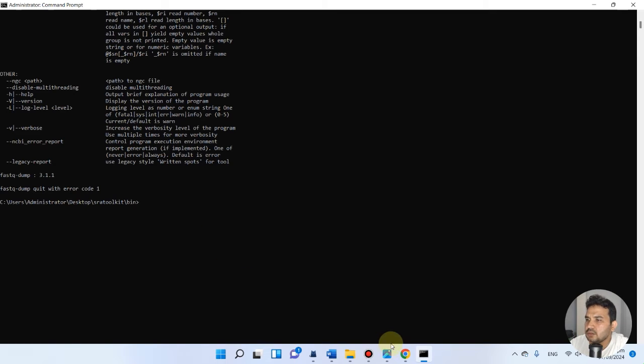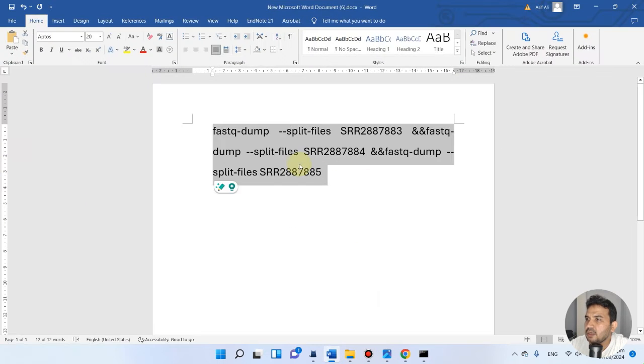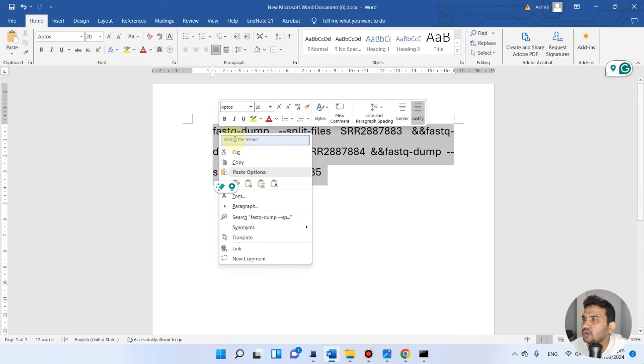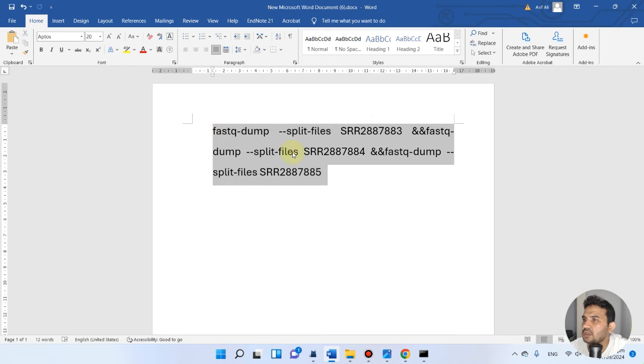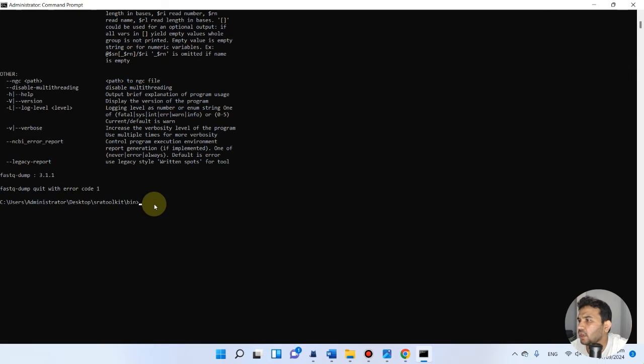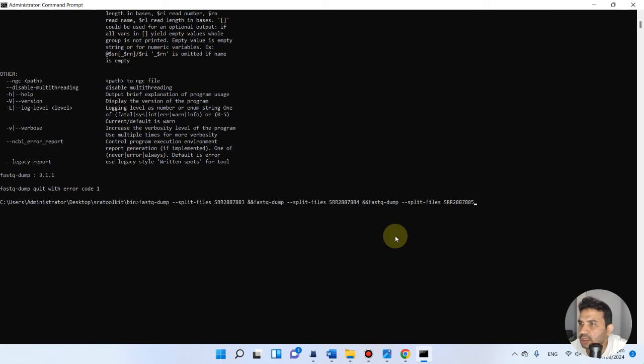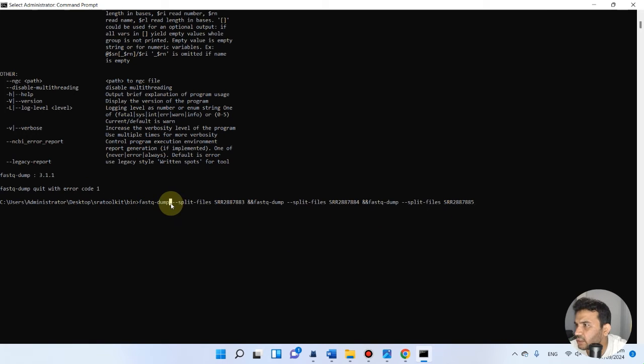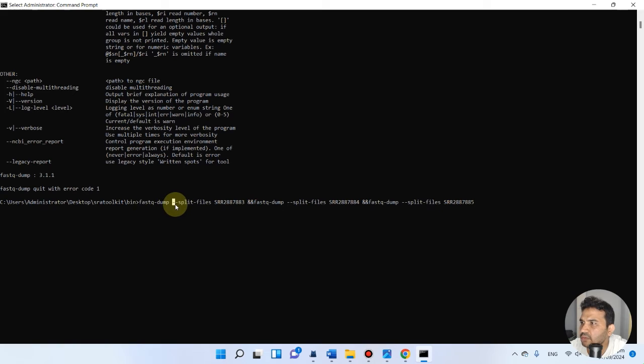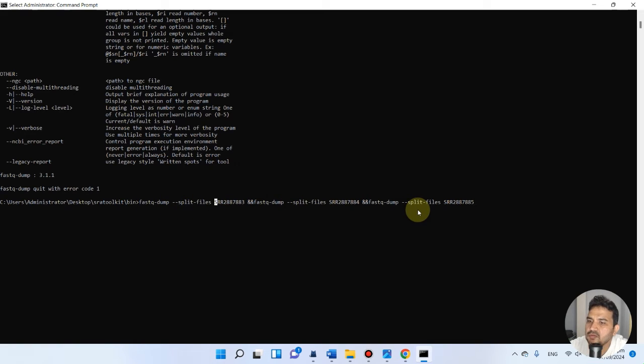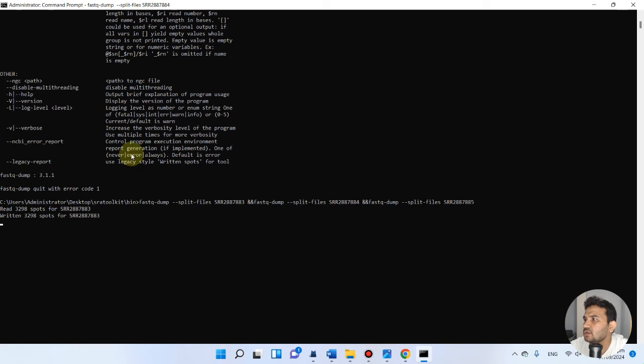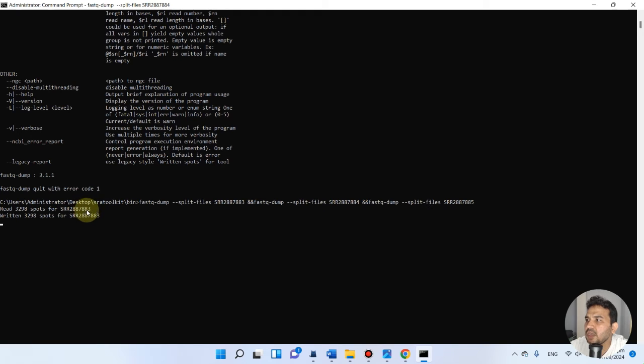Let me go back. We can go back here. Oh, there was actually a space - there should be no space. Okay, now we can check. Now there is no space. Fastq-dump, and then we've just pasted those files and enter.